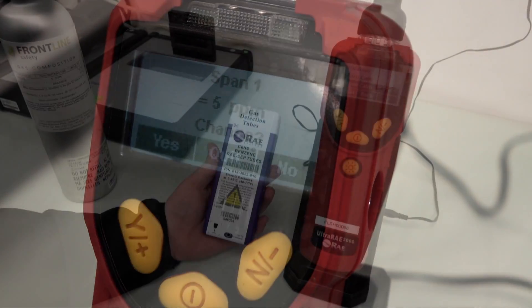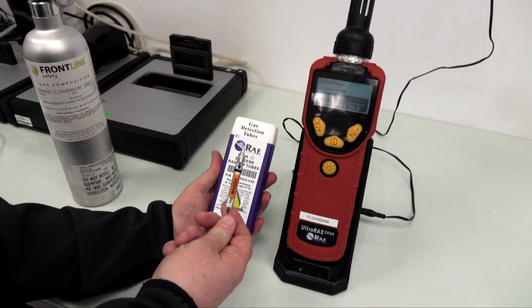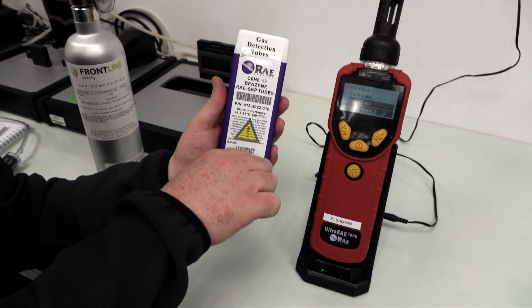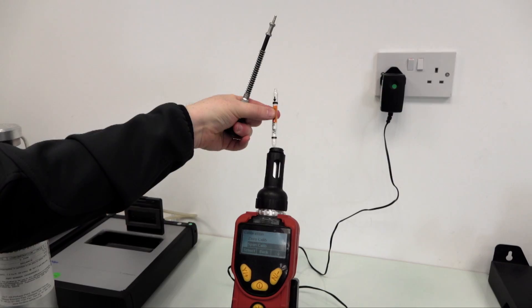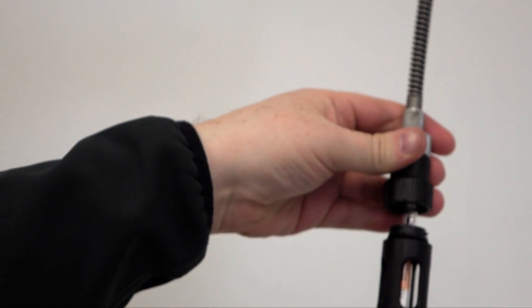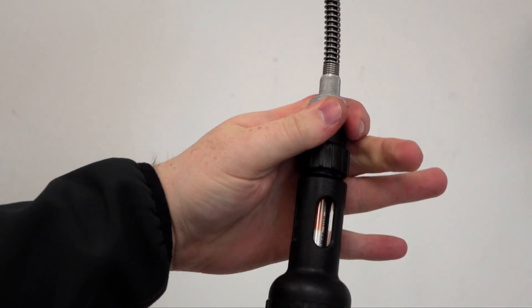Before inserting the separation tube, be sure to use the tube breaker in the front of the pack to ensure that the gas can flow freely from one end to the other.